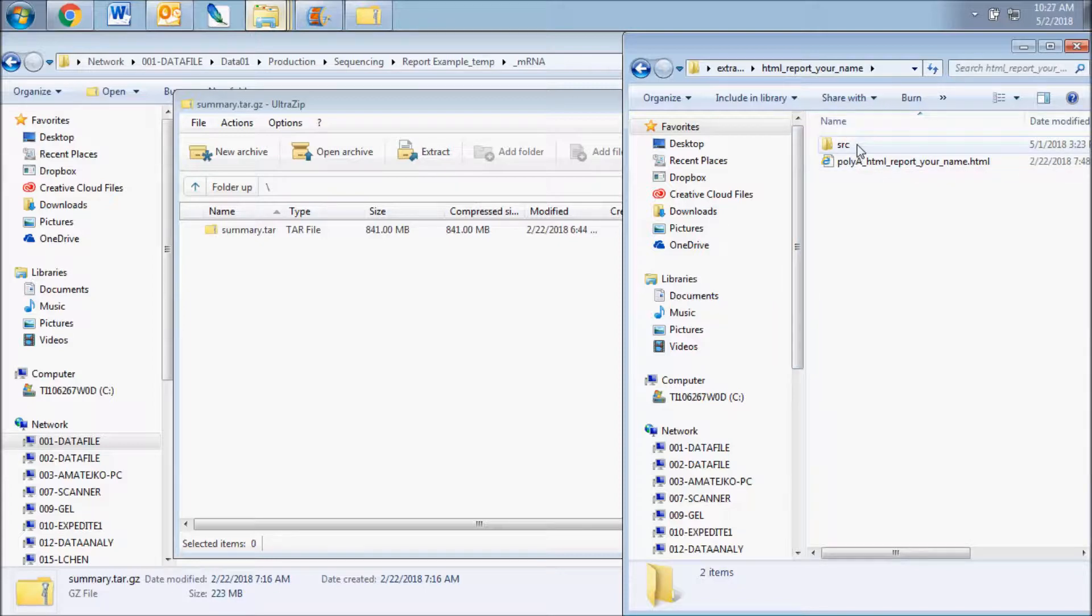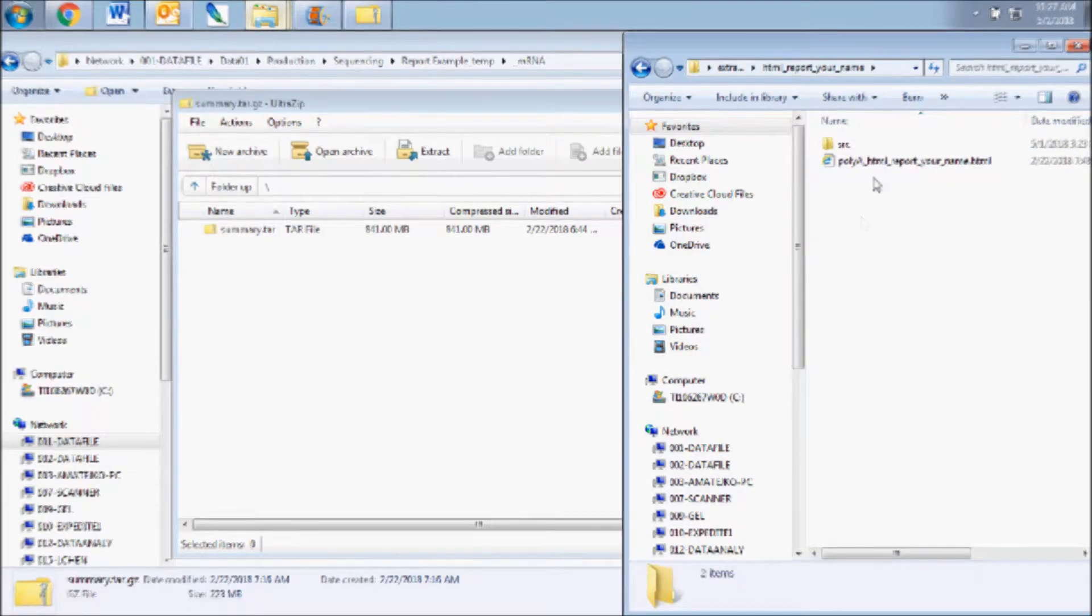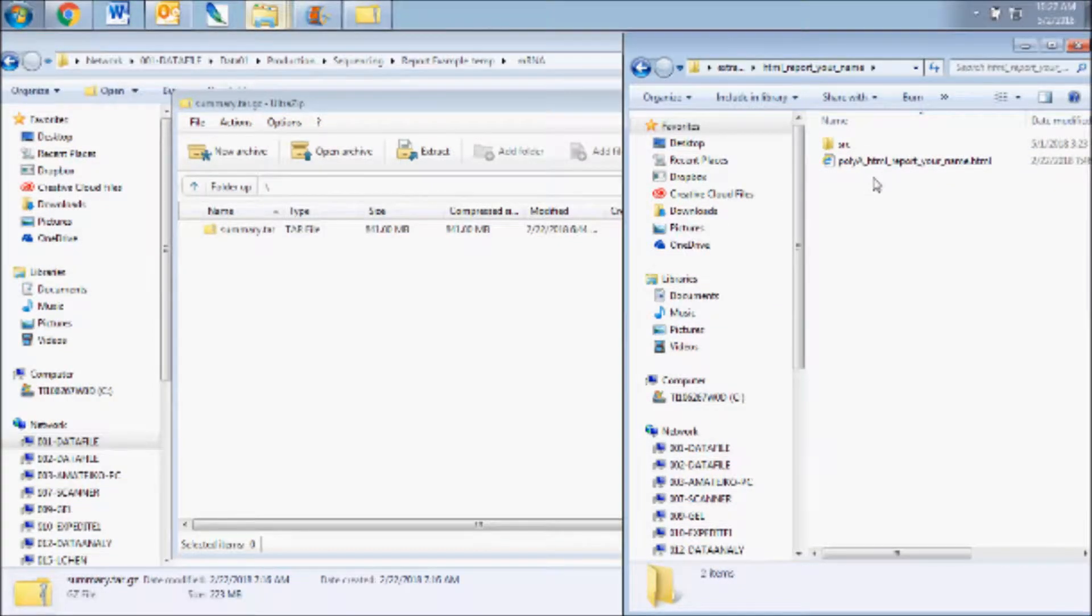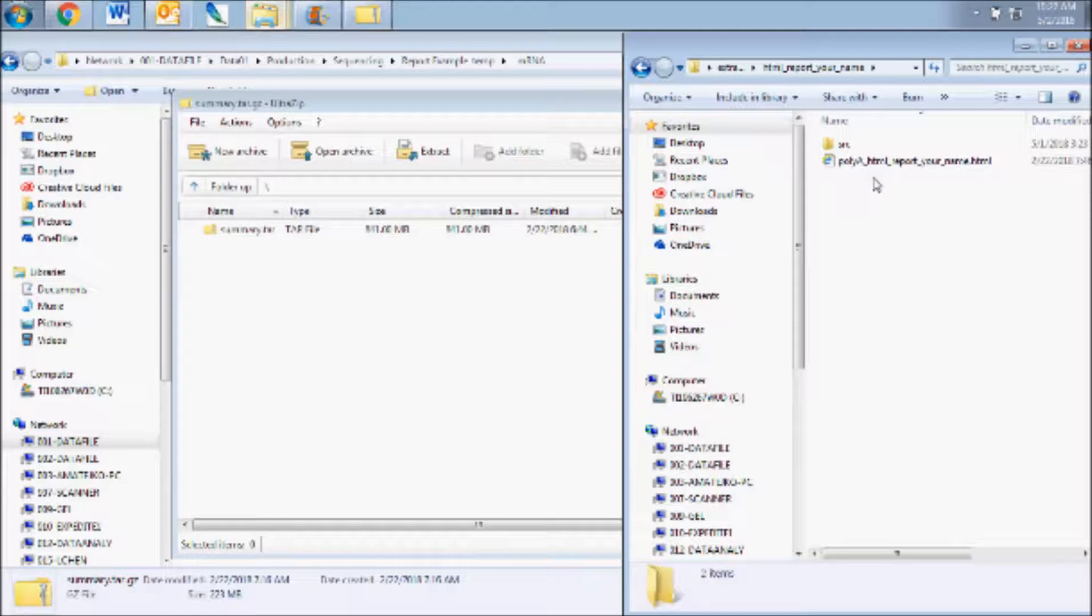If you move files or folders around, make sure the SRC folder stays with the HTML file as it contains the data sources viewed through the HTML file.